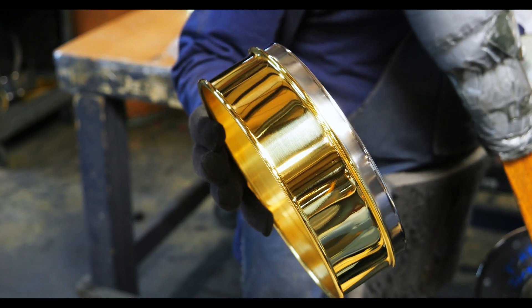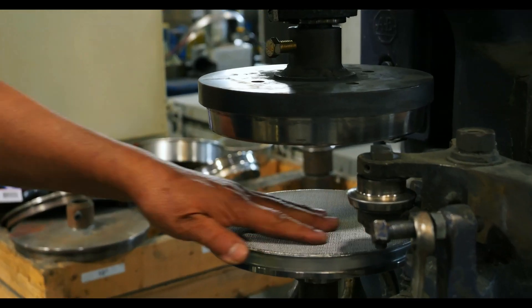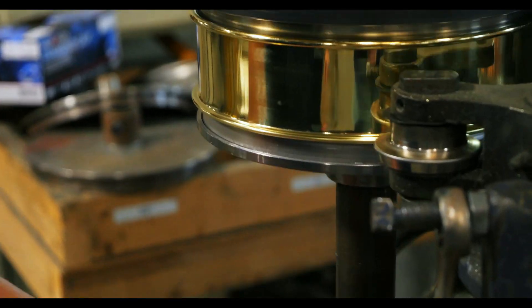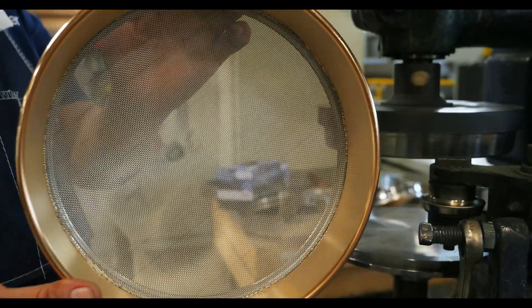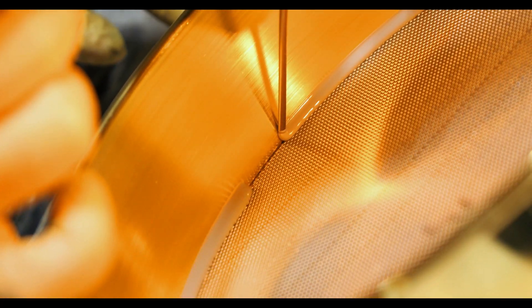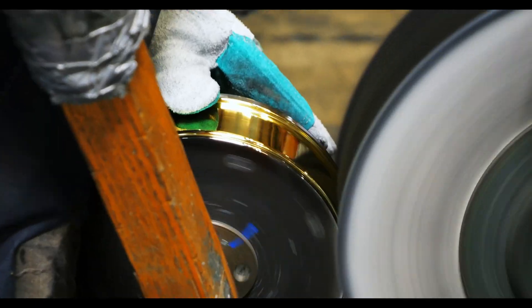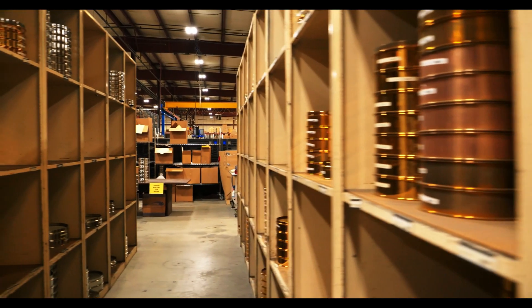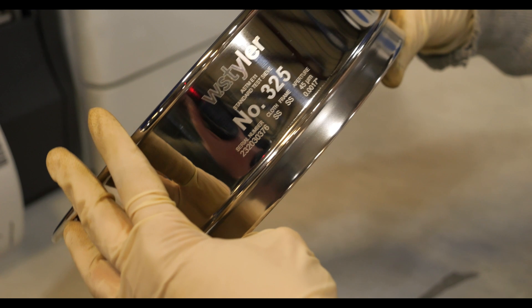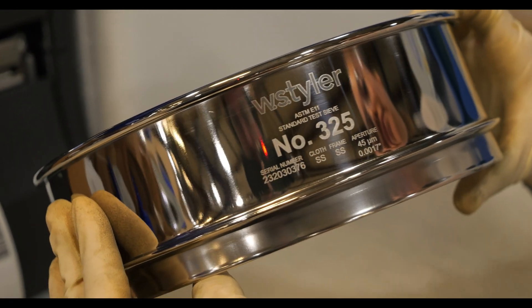A testive is, in its simplest definition, wire sieve cloth mounted on a rigid frame. The mesh is affixed to the frame and tensioned to ensure that it meets the ASTM or ISO standard. A bead of epoxy is placed in the groove where the mesh meets the frame to prevent any particles from getting trapped and skewing your particle analysis results. The testives are then polished and put into inventory. Serial numbers are permanently etched onto the sieve frame and a certificate of compliance is printed at the time of shipment.